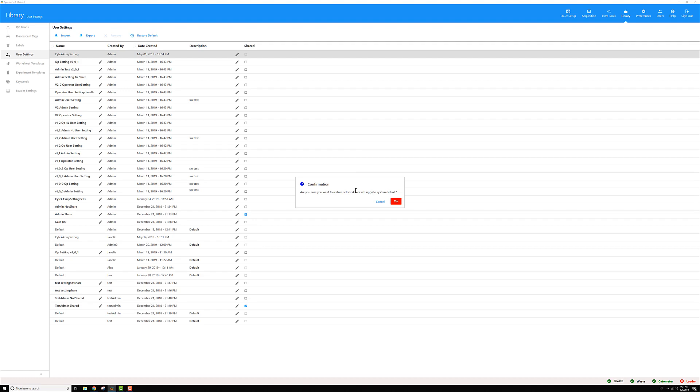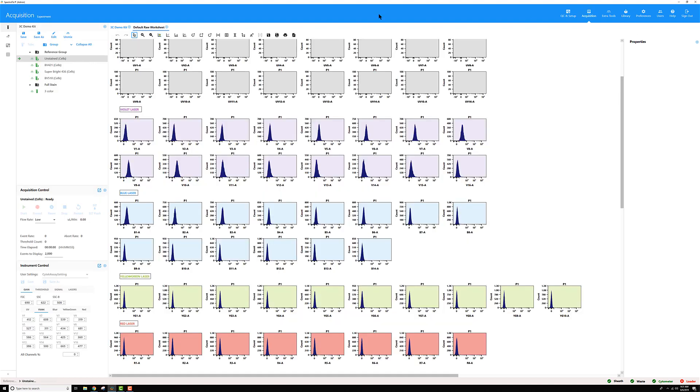Again you'll get that confirmation pop-up, go ahead and click yes. Then when you go back to your experiment now you can see the values look more what you'd expect, not like someone typed in the same number over and over again.